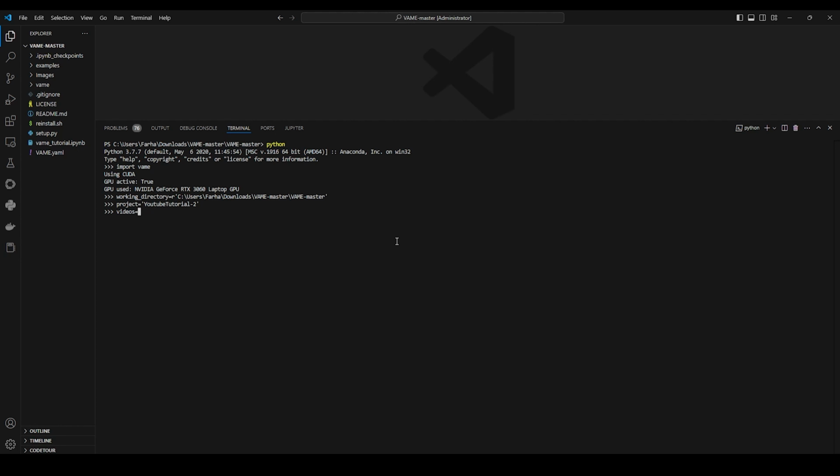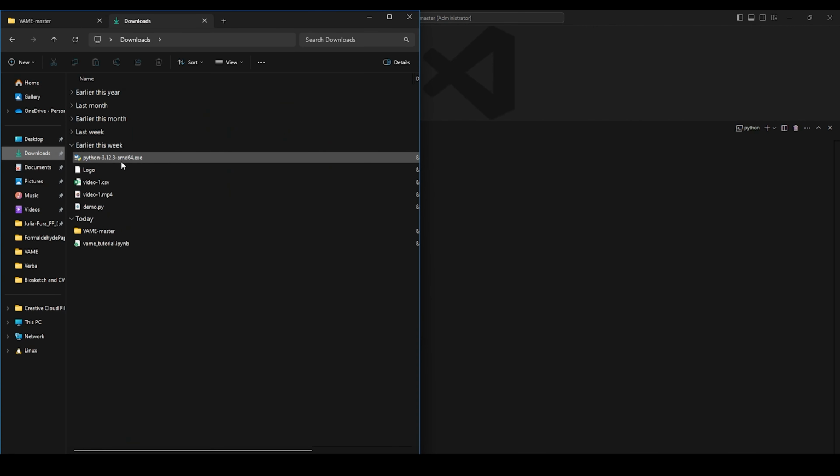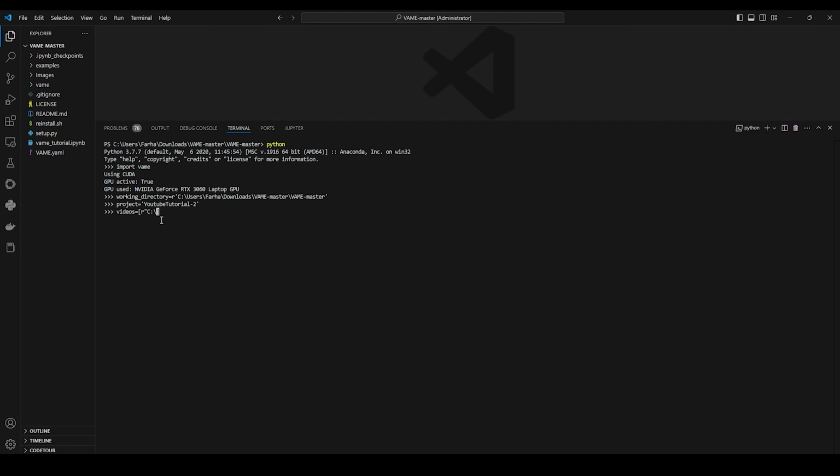So the path to videos, I need to provide. So here's one video, copy as path, put that in like that. Okay, so I'm only using one video. Obviously, if you want to use more videos, you can create a list here.